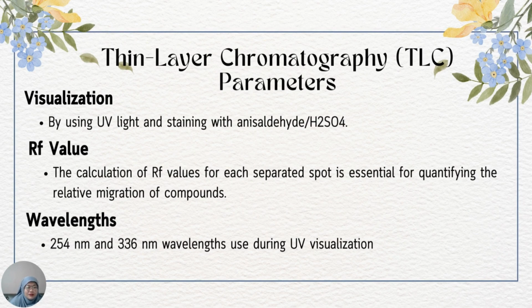And for our visualization methods, we use UV light and staining with anisaldehyde. So UV light allows the detection of compounds that absorb UV radiation, while staining enhances the visibility of spots.